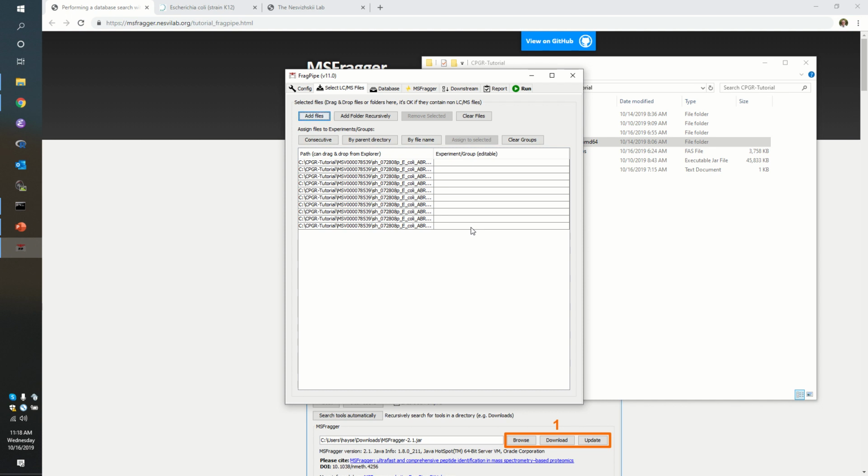All right, so at the moment, we know more about the raw files than MSFragger does, or than FragPipe does. You remember that our file names told us that some of these represent reds and some of these represent yellows. We are going to use the FragPipe interface to tell us how many spectra are seen for each protein for each input file, right?